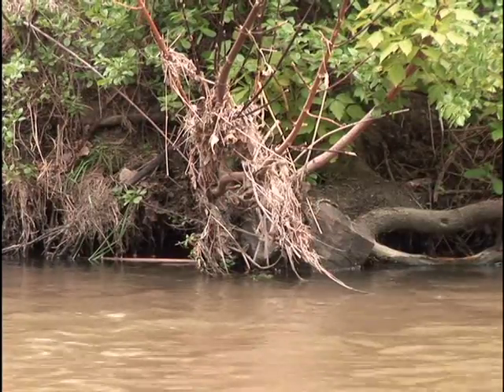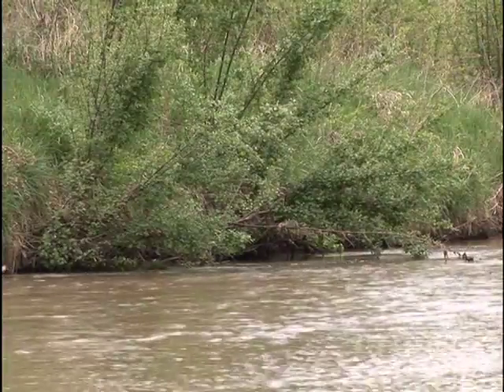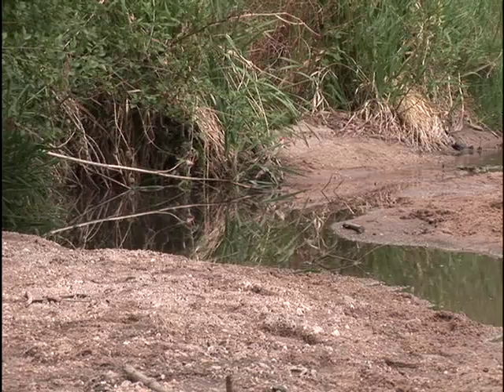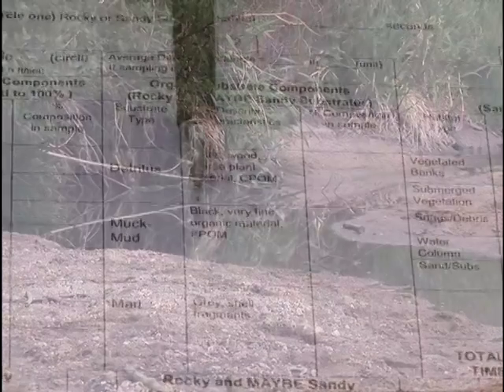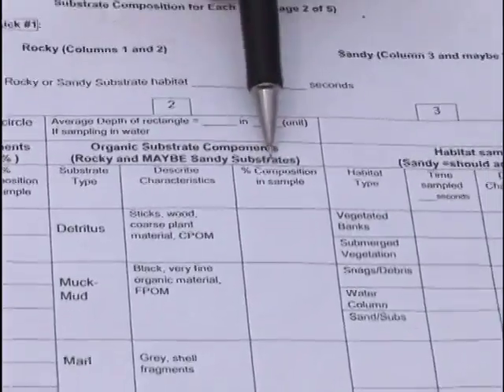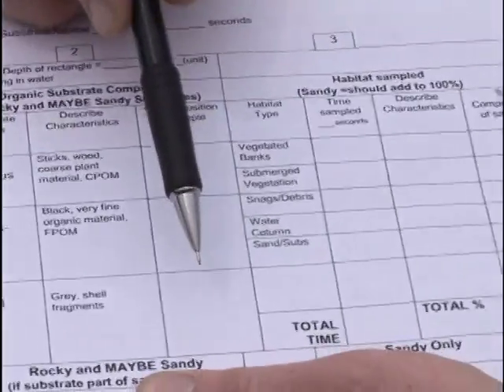We also need to understand if there's any organic substrate within the habitats that we've sampled. Describe any sticks, wood, coarse plant material, any muck or marl, which is this black, very fine organic material. Describe what percent of each is in the sample. This may not equal 100.